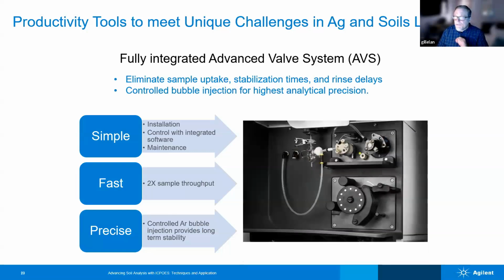The installation is tremendously easy. It goes in a little panel that is otherwise empty on your instrument. It comes standard on the 5900. On the 5800, it is an available upgrade. I think it's actually user installable. It's incredibly simple, and I've actually done it, so it should be user installable if it isn't.